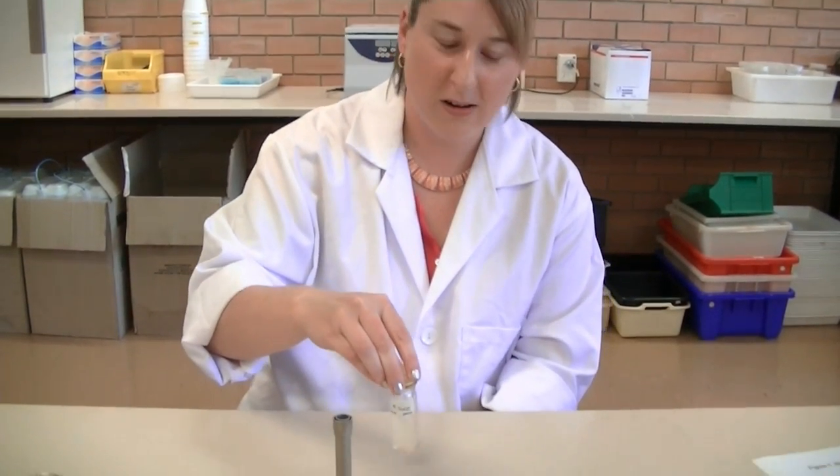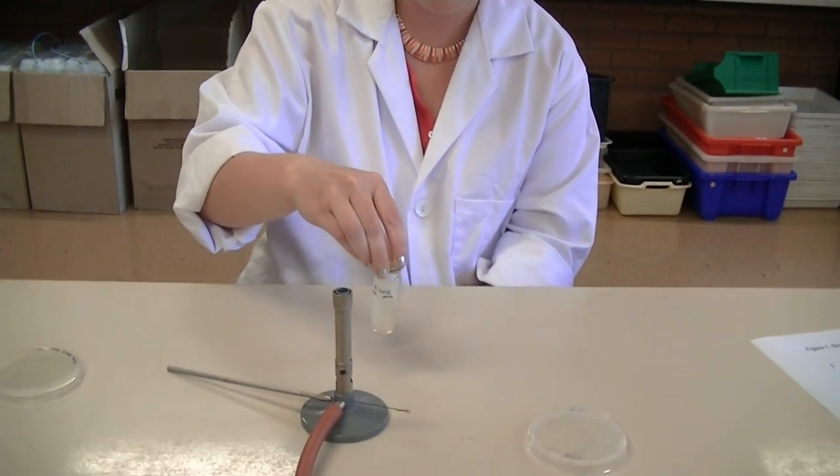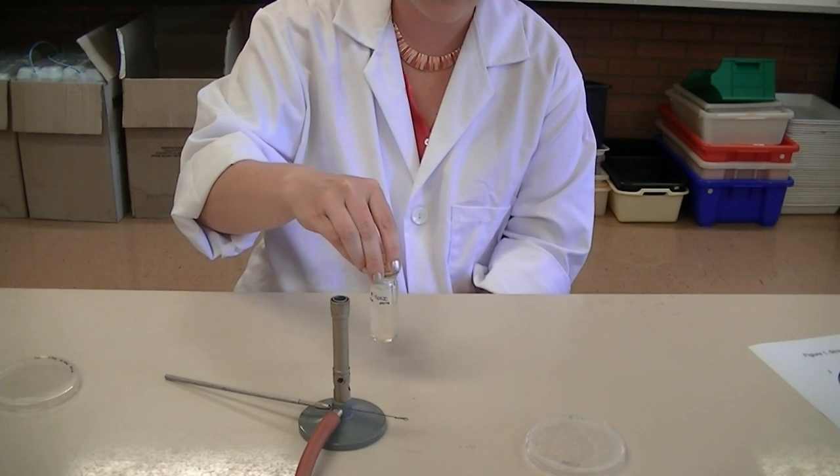That was a demonstration of how to perform the streak plate technique using a bacteria from a solid surface. Now we're going to do it with a liquid broth. Here I have some E. coli in a broth — give it a quick swirl to make sure that the cells are suspended throughout the broth.